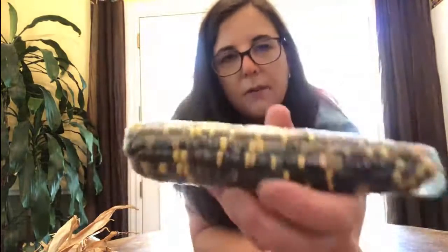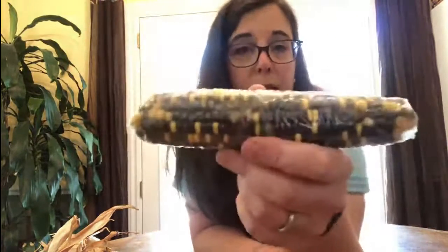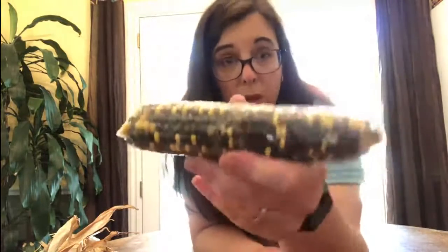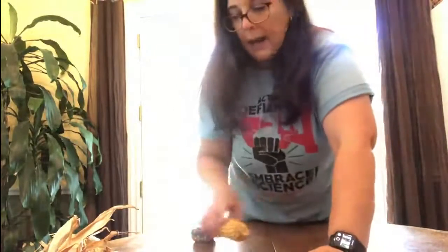So for this experiment, we're going to be counting the F2 generation. This cob represents an F2 generation, but again, it's hundreds of offspring. Obviously, the more you actually count, the closer you are going to get to Mendel's ratios. But in this case, I've set up some samples of our field of corn for you. And if you were in class, you would take your sample, open it up and dump it out, and then start sorting it according to the different double phenotypes.